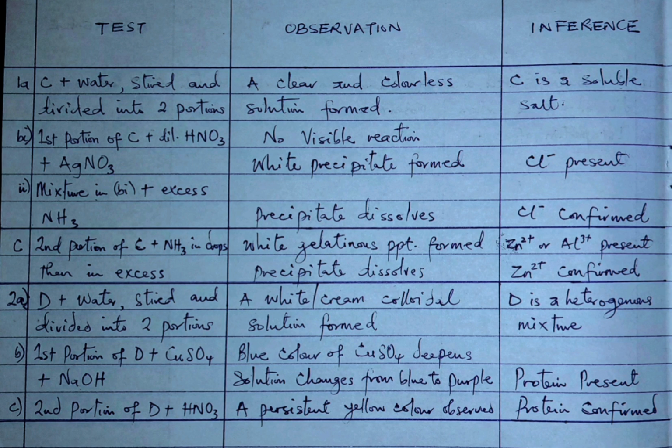the Biuret test is just a chemical test that tests for peptide bonds, and peptide bonds are the bonds that hold amino acids together, so that the amino acids come together to make up proteins. So indirectly, the Biuret test is used to measure the amount of protein in a substance.